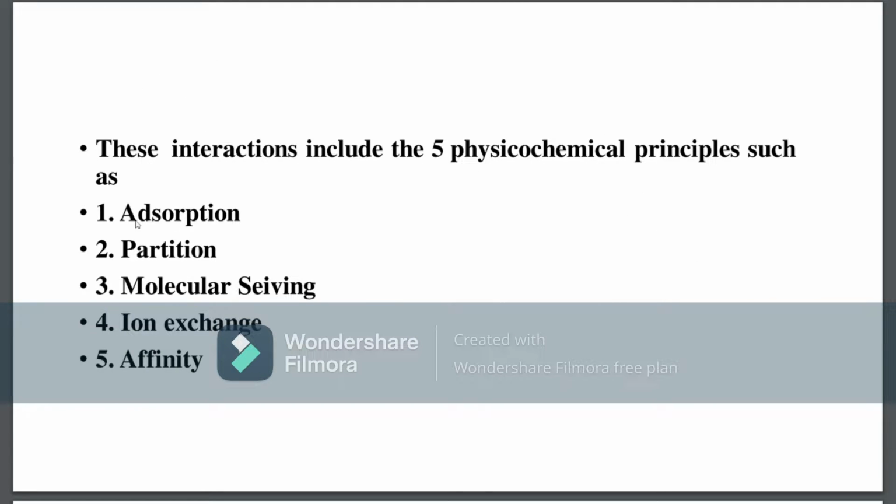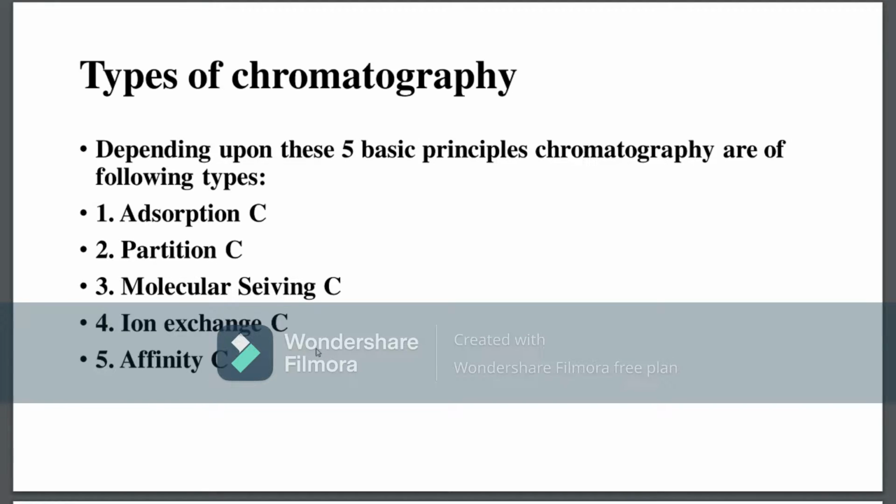Basically, these interactions include 5 physicochemical principles. The whole of chromatography is based on these 5 physicochemical principles: adsorption, partition, molecular sieving, ion exchange and affinity.